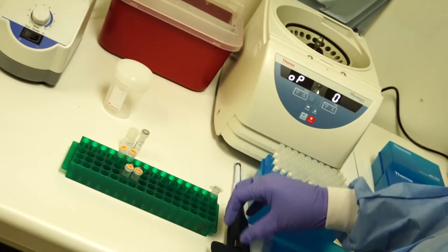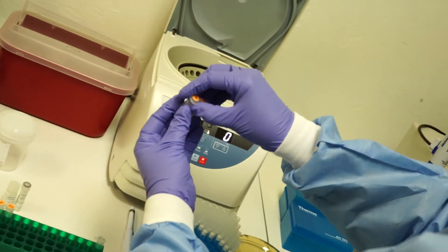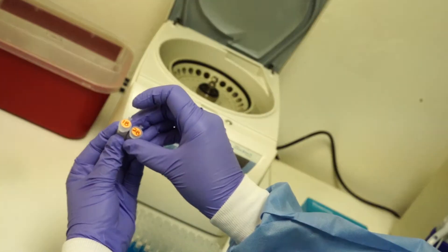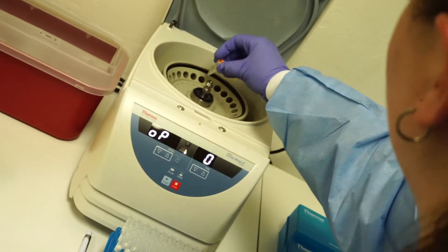Once you have transferred your supernatant, place the samples back into the centrifuge. This time you will spin at 14,000 rpm for 3 minutes.